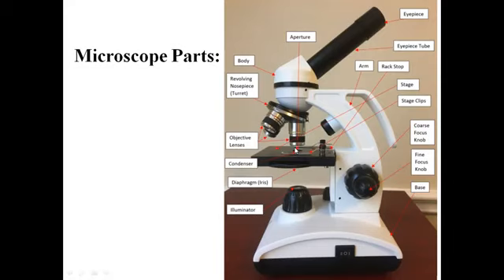So how do you control that light? Here we control that light with the help of this diaphragm. We can rotate the diaphragm and limit the light that is coming from the illuminator and falling on the sample. Okay. So that is the function of your diaphragm.